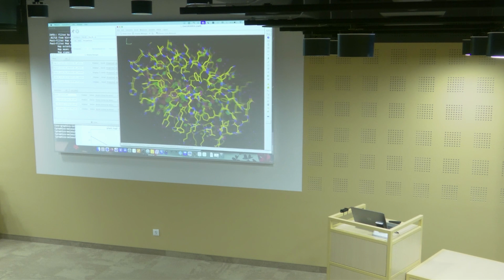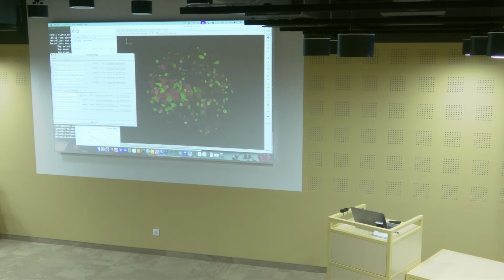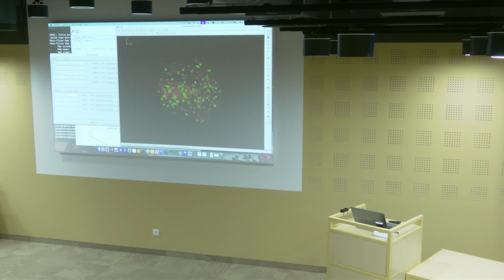Now, what I typically like to do is disable my model and zoom a bit out. And now I just start walking through the unit cell. If I change the contour level a bit, what is clear now is that I have peaks at specific locations. So this is a confirmation that I have peaks here and not there.